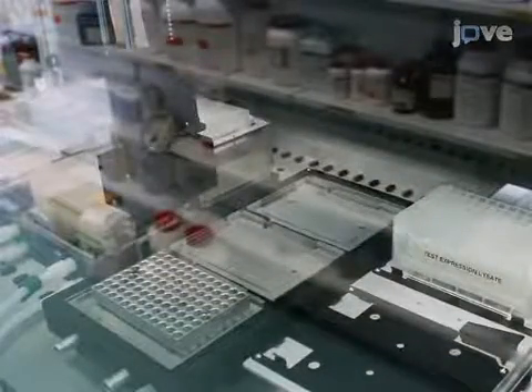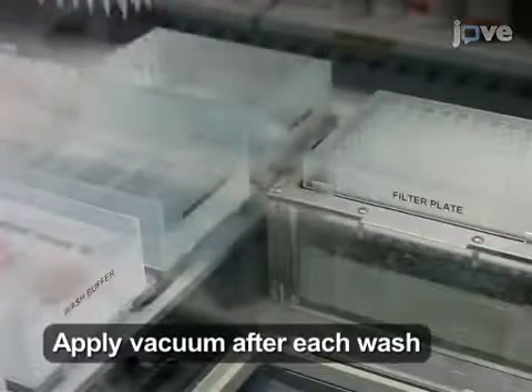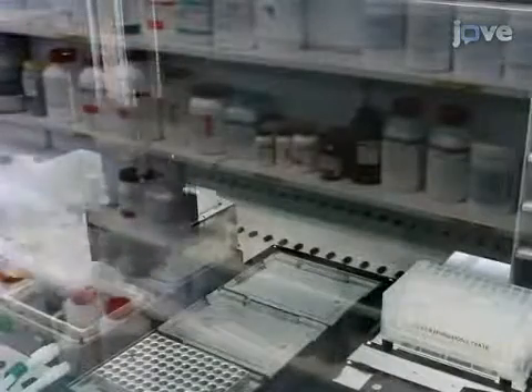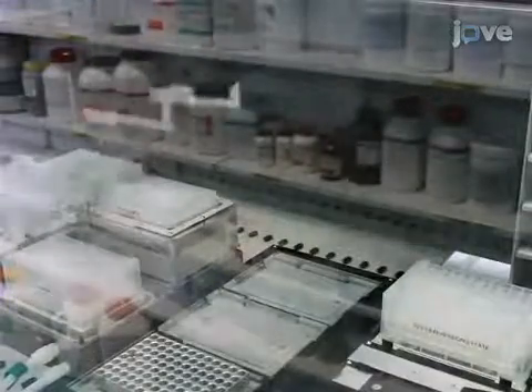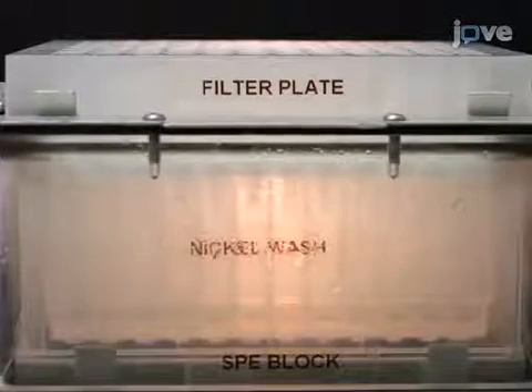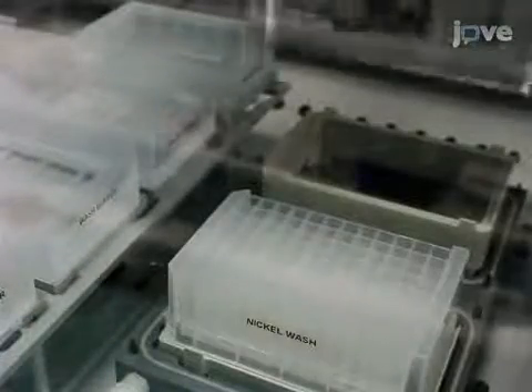The deep well 96 containing the flow-through is removed from below the filter plate and stored on a rack until the end of the experiment. Then wash the resin twice with 800 µL of binding buffer each time. After the second wash, use the robotic gripper to place a fresh deep well 96 plate under the filter plate to collect the 50 mM imidazole wash. Add 150 µL of wash buffer onto the filter plate and apply the vacuum again until the buffer has passed through. The deep well 96 containing the wash is removed from below the filter plate and stored on a rack until the end of the experiment.